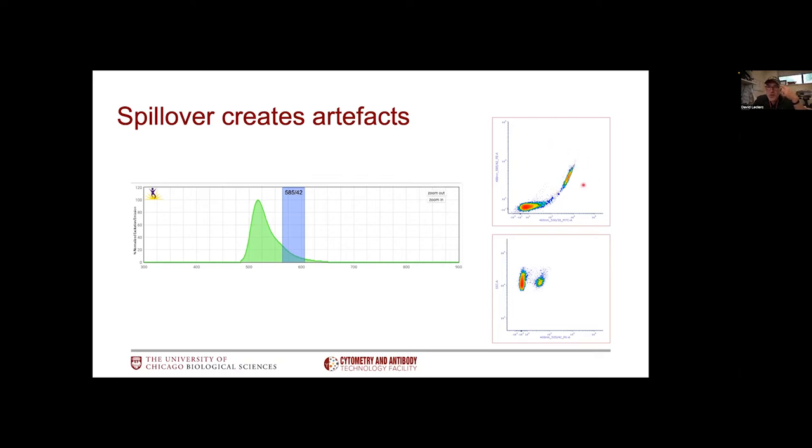In general, when you see a diagonal, that indicates that as one marker gets brighter and brighter, it bleeds more and more in the secondary channel. Another way of looking at it is looking for these artifact positive fractions that are biologically irrelevant. If you see that next to your negative population, that typically indicates some kind of problem with the overlap that has not been corrected properly.